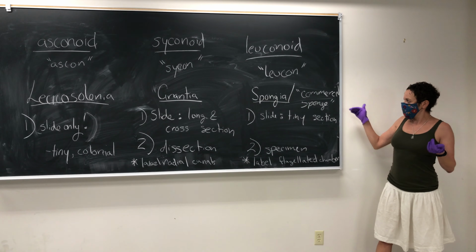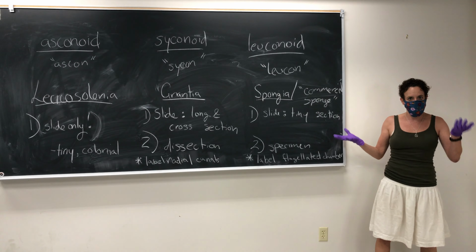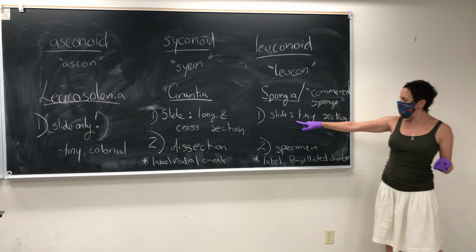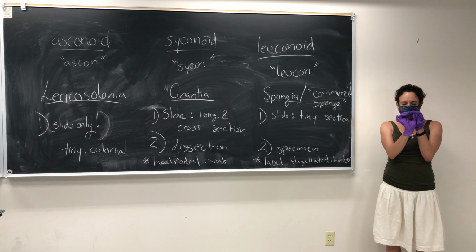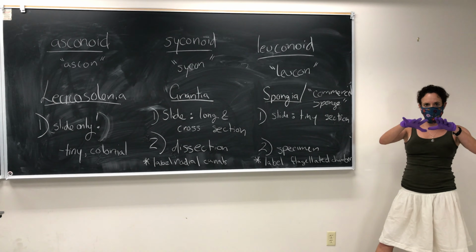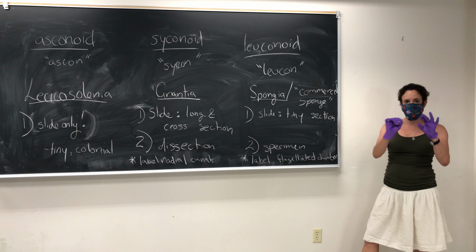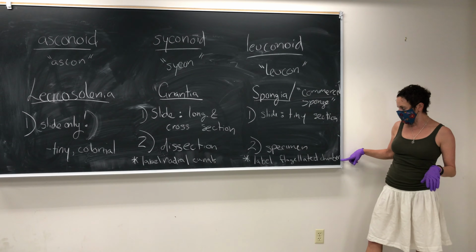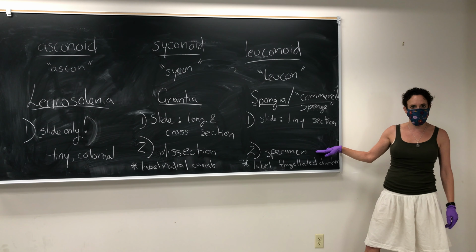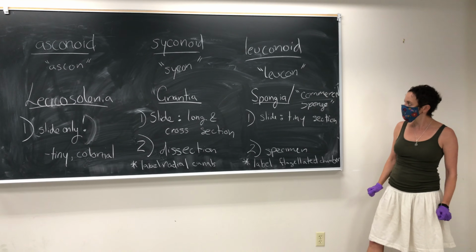All of our specimens are labeled as Spongia or commercial sponge. This genus is also called the commercial sponge because it used to be collected for people to bathe with or use for cleaning. The slide is a tiny little section, and we can't call it a cross or a long section because these guys are roundish in shape. What you'll see are little empty holes, and those are the flagellated chambers. You should also be able to recognize these in the specimen photos.